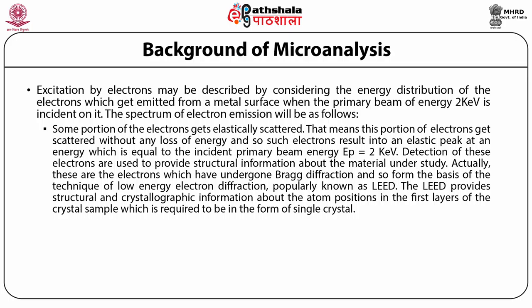Detection of these electrons is used to provide structural information about the material under study. Actually, these are the electrons which have undergone Bragg diffraction and so form the basis of the technique of low energy electron diffraction, popularly known as LEED. LEED provides structural and crystallographic information about the atom positions in the first layers of the crystal sample, which is required to be in the form of a single crystal.